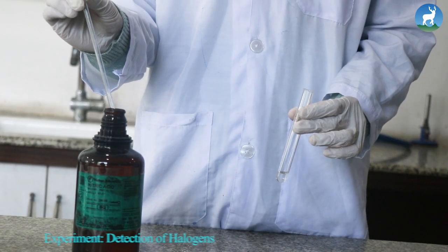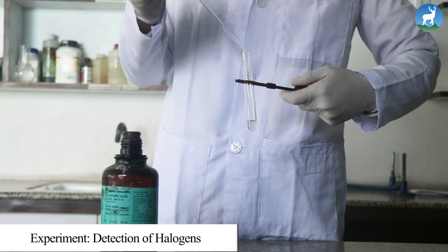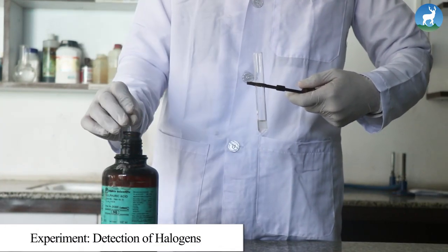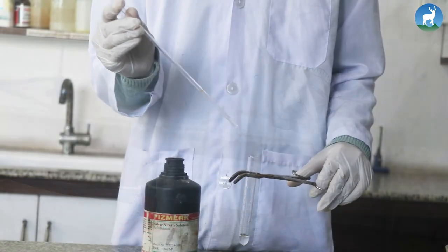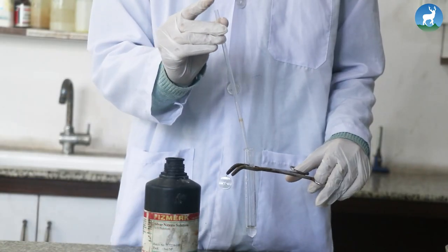Detection of halogens: Add few drops of concentrated HNO3 into 2 ml of sodium extract. Boil it and cool it for a few minutes. Then add 1 to 2 drops of silver nitrate solution.